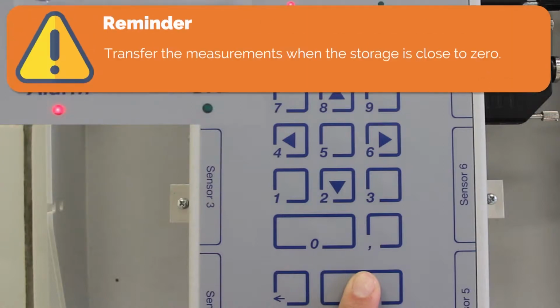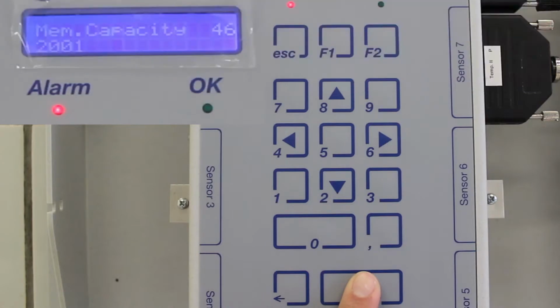Reminder: transfer the measurements when the storage is close to 0. Then, press Enter. The erase memory wipes out all the measurements in the Aquastar.